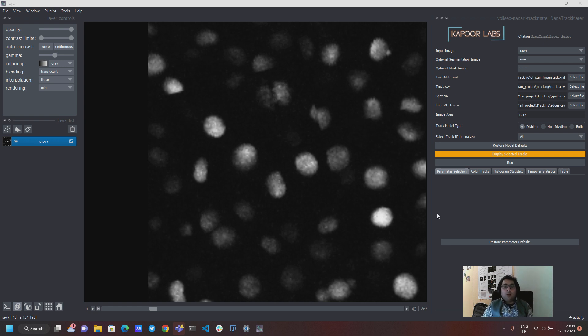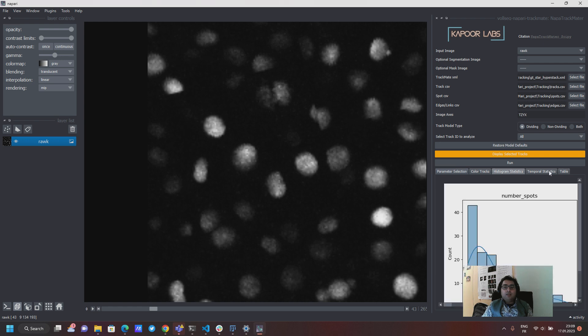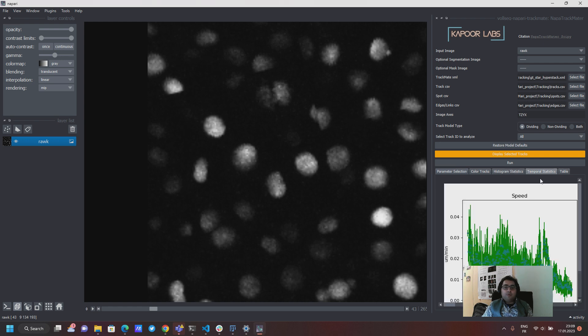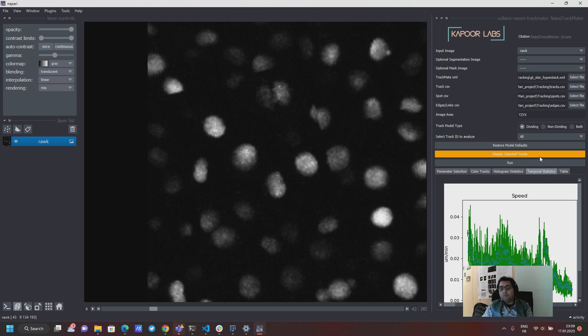As you know this plugin is in constant development and before you have seen that you can actually get these kind of histogram and temporal statistical plots that you see over the tab here after you load these XML and CSV files and hit the run button.